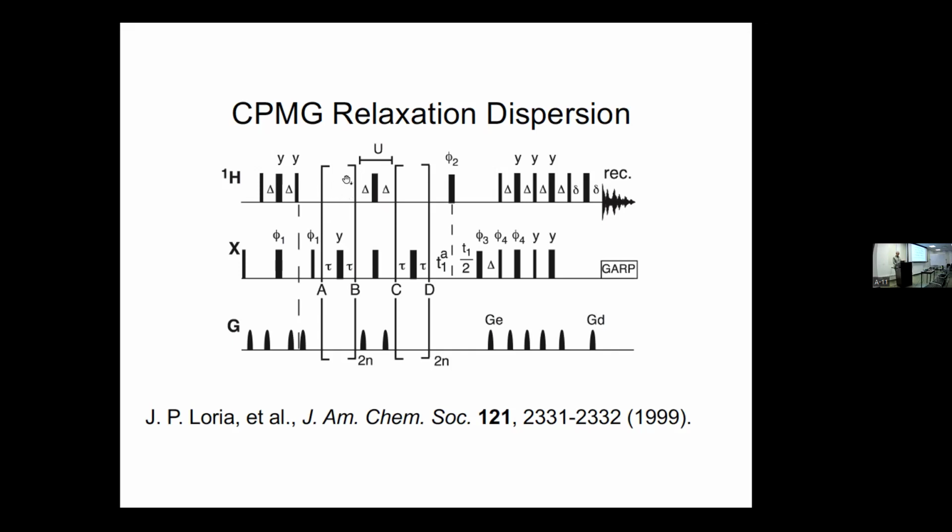So you couldn't put a super cycle in here, and we had earlier shown, when I was still a postdoc, that trying to do that led to enhanced decays because the imperfections in the decoupling led to faster decay.